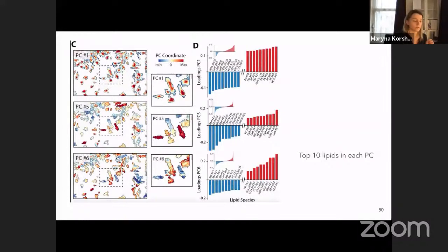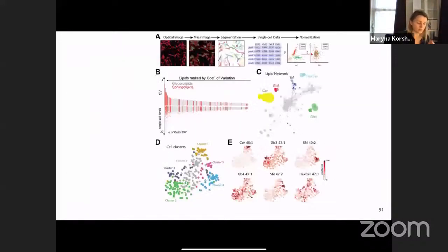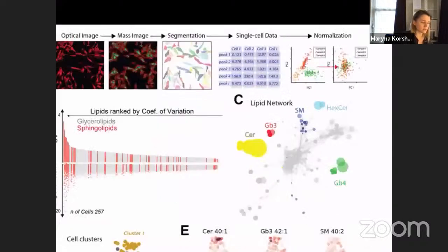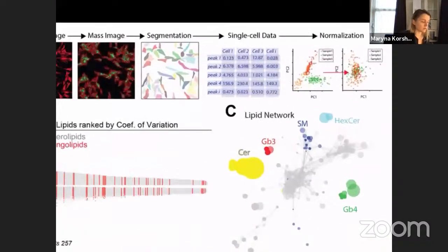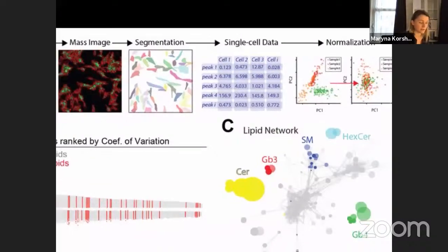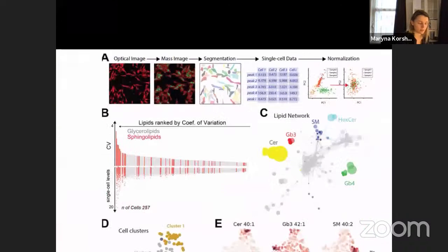So just to sum up, I was really surprised that it's very similar to single cell analysis. Even if you look at these pictures without any content, for example this single cell data, if you remove the labels peak 1, peak 2, peak 3, you will see the same table as a single cell count matrix, maybe already normalized or processed. And further steps of data analysis are the same: normalization, scaling, and so on.